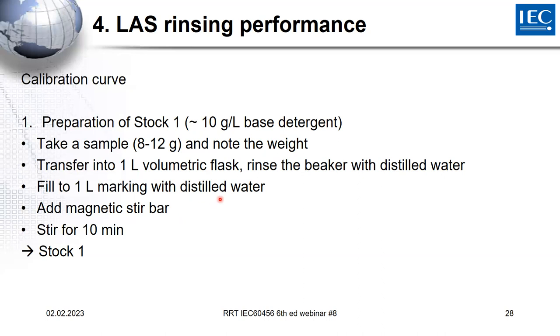Okay, just one question. You say rinse the beaker with distilled water. What do you mean with that? Do you discard it? No, this rinsing water is, of course, collected in the volumetric flask. Okay, yeah. So wouldn't it also be okay to just leave the rest of the sentence away and say, okay, I transfer the detergent into the volumetric flask, and then I fill up to 1 liter? You mean something like this? Yes. Okay. No problem. Yeah, you could do it. I was just confused. Sorry. Thank you. Okay. No problem.